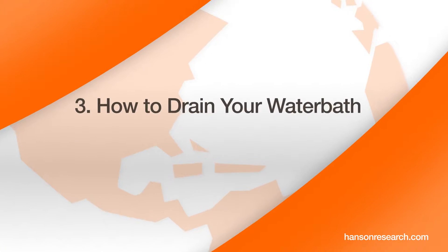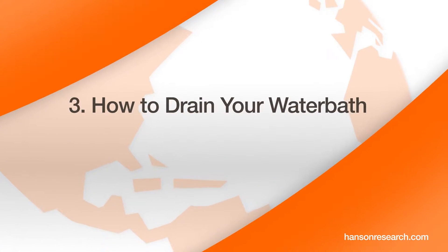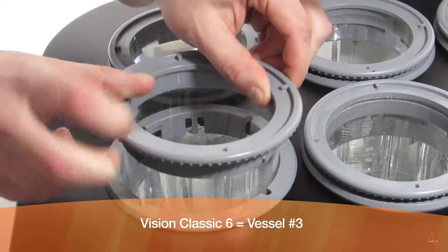How to drain your water bath. Remove vessel number 5.